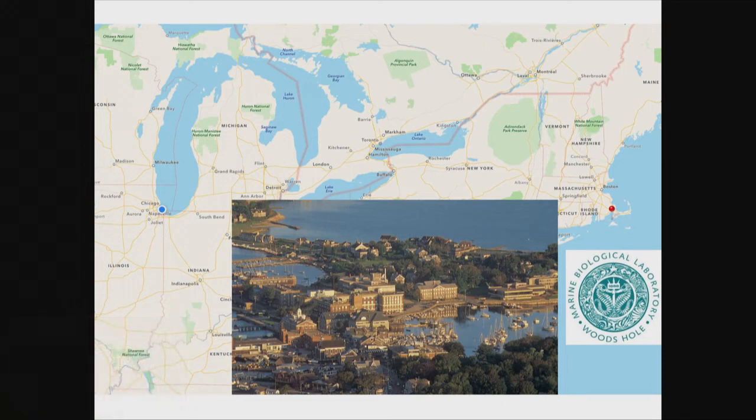That's a problem that we also try to solve in conjunction with polarization, which typically introduces a nonlinear relationship between the image and the object, so it's even more complex in a way. So the collaboration with Chicago is really very helpful for us, which has a strong medical imaging group.